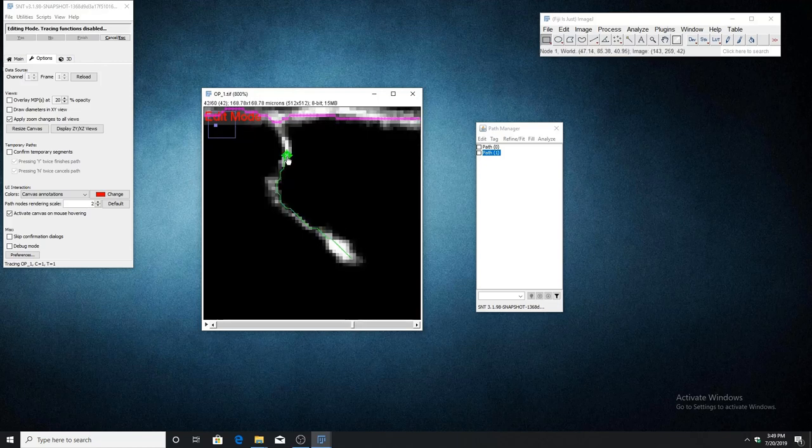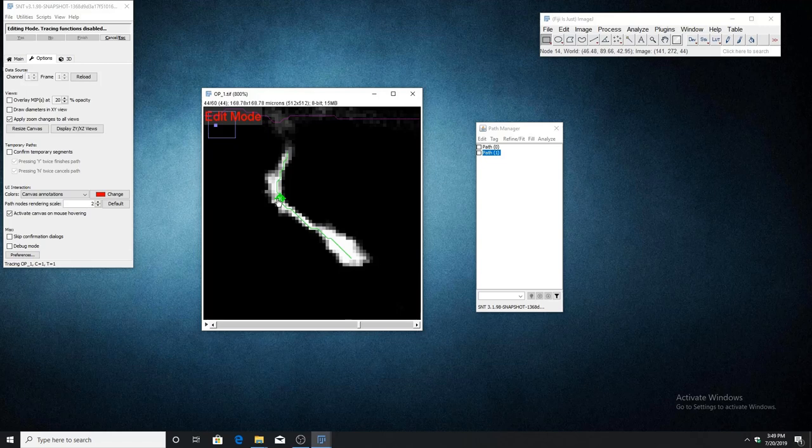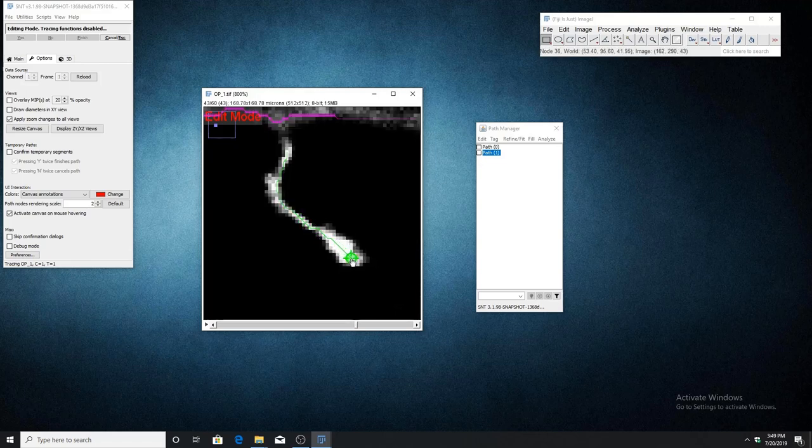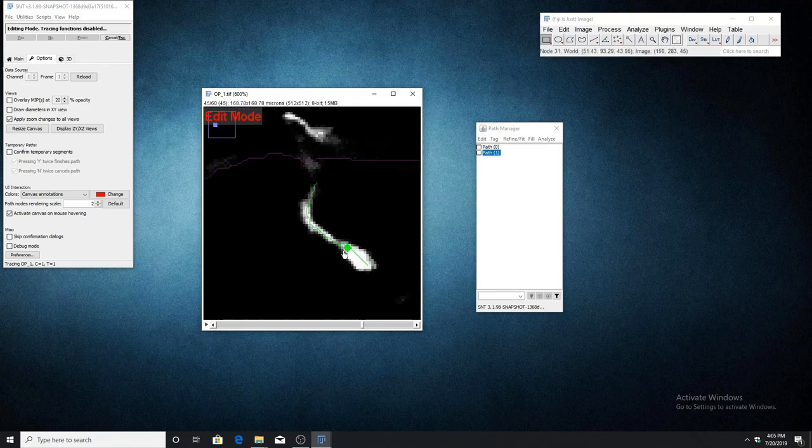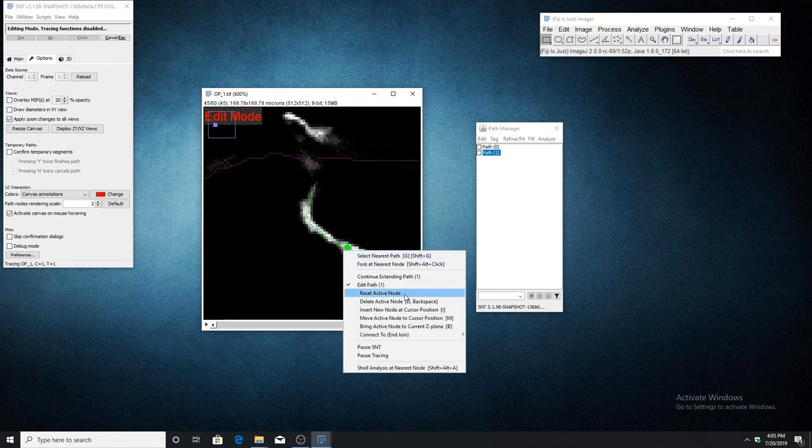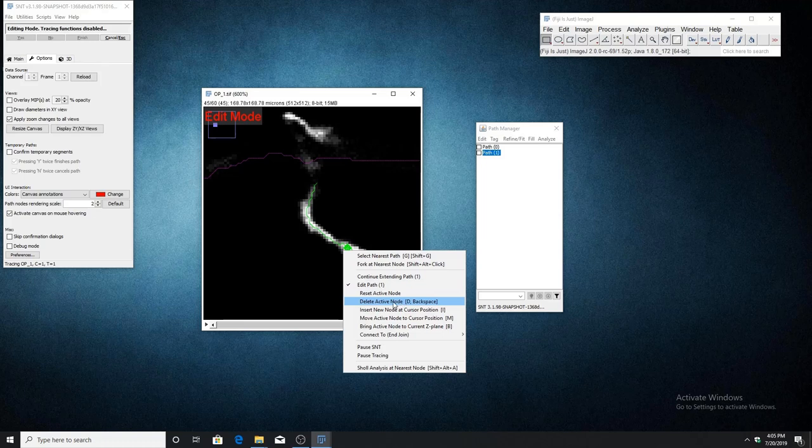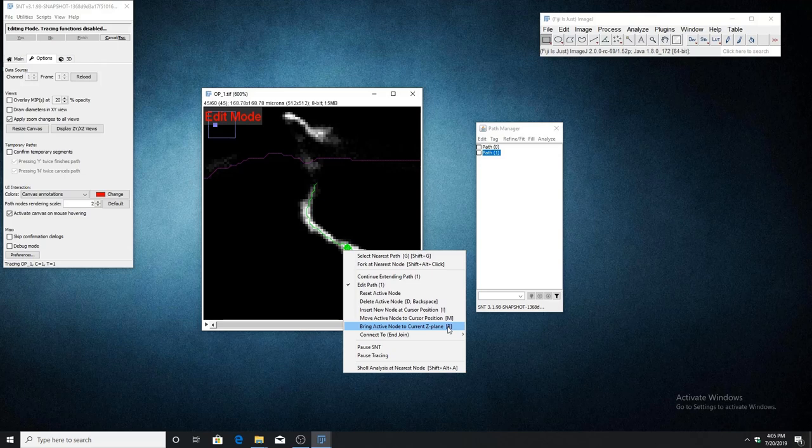You'll notice that if I move my cursor along the path, it activates the nearest node, meaning that we will be able to edit it. The first function I'm going to go over is delete active node. For all of the editing functions, the corresponding keyboard shortcut is shown to the right of each option.